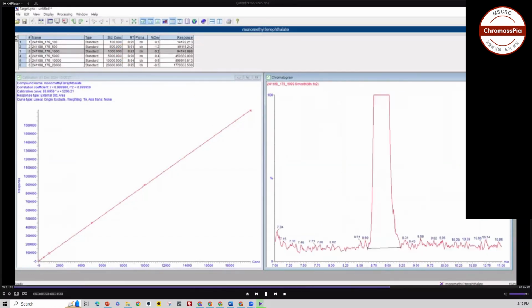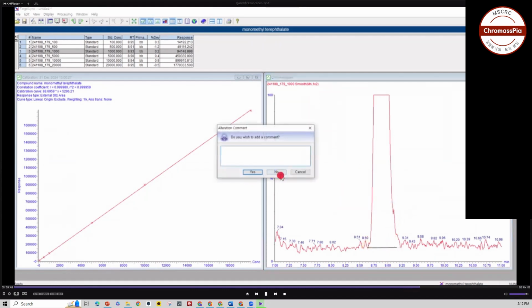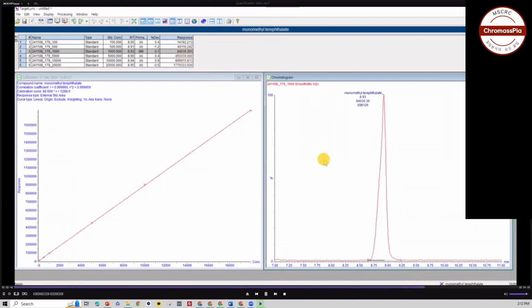The assigned area can be manually adjusted. And you can save it. If the areas are not automatically adjusted, you can use AdPic to manually set them.